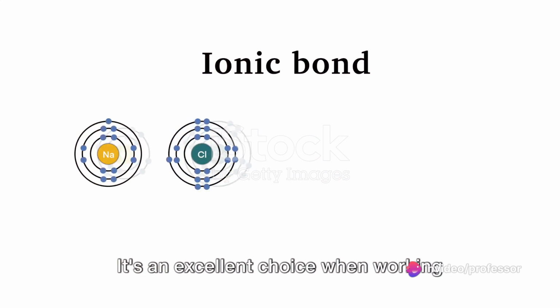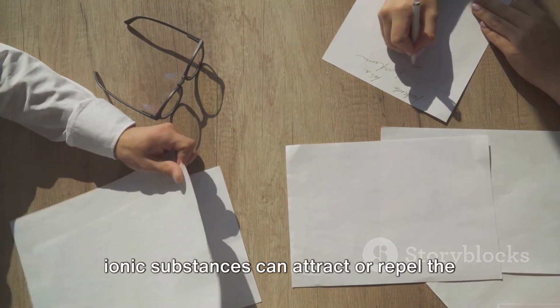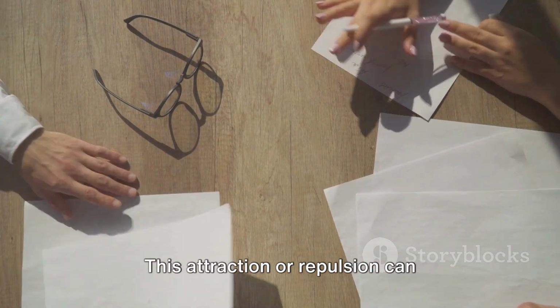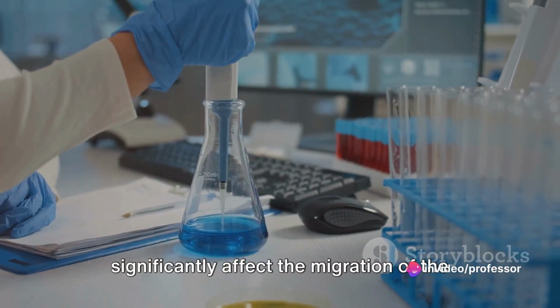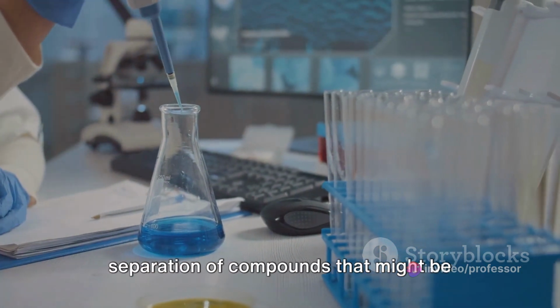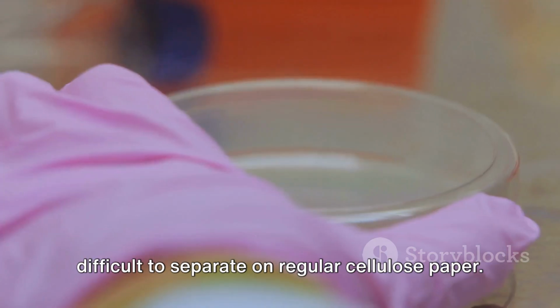It's an excellent choice when working with compounds that have a charge, as the ionic substances can attract or repel the compounds depending on their charges. This attraction or repulsion can significantly affect the migration of the compounds on the paper, enabling the separation of compounds that might be difficult to separate on regular cellulose paper.